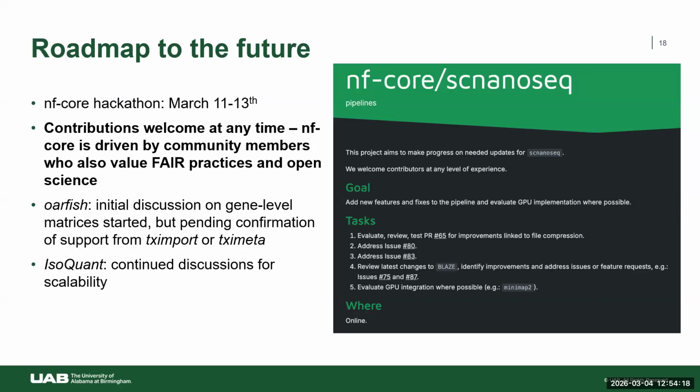So this is actually now part of one of the projects under the NF Core Hackathon. Anybody is welcome to join. If nobody joins, Austin and I will still do the work. That doesn't matter. But I am hoping to at least get contribution from NVIDIA. Actually, NVIDIA was here a couple of weeks ago, and Ben said, hey, we're going to be part of the NF Core Hackathon. So we added this one item in here, in addition to a couple of other things that we can do, which is to implement GPUs where possible.